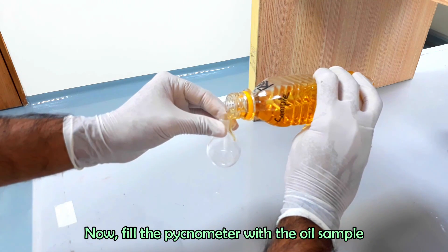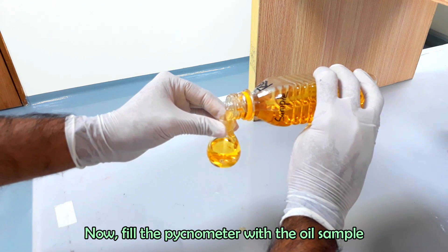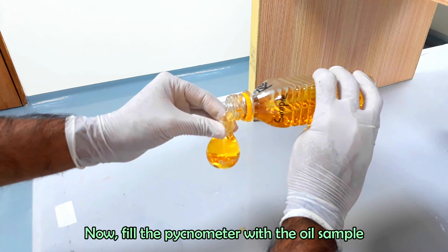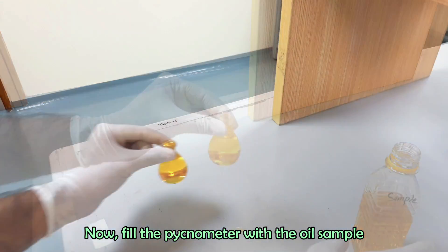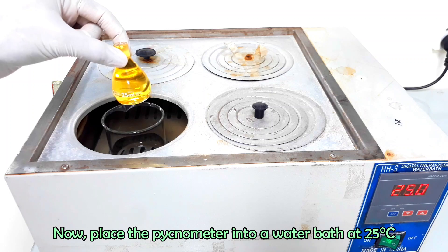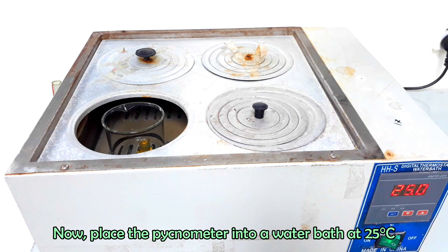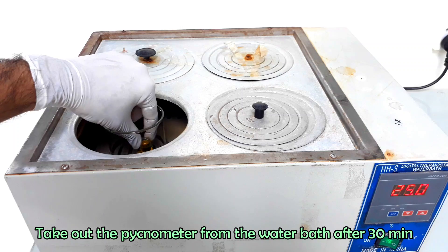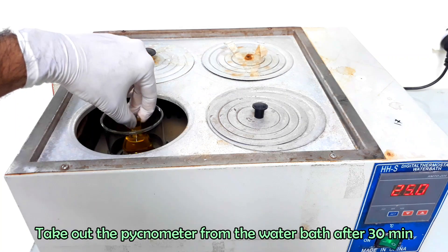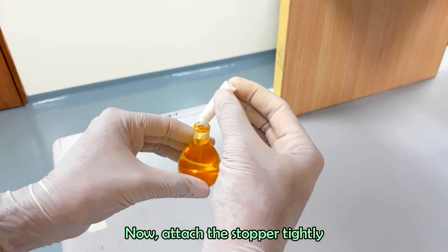Now fill the dry pycnometer with sample. Place the pycnometer into a water bath at a constant temperature of 25 degrees Celsius for 30 minutes. Take out the pycnometer from the water bath after 30 minutes. Now attach the stopper tightly.